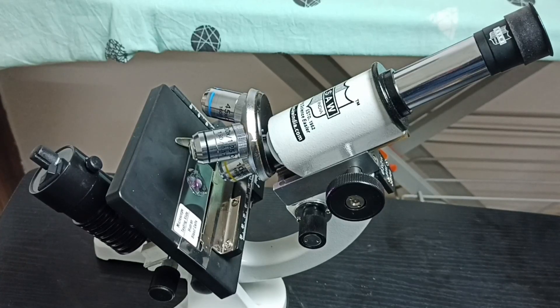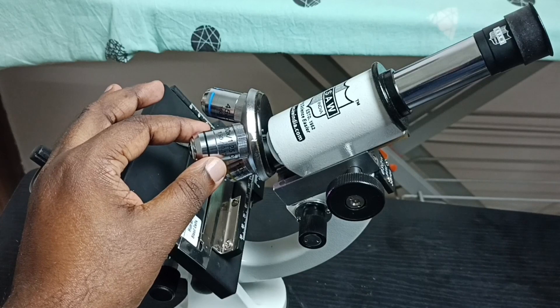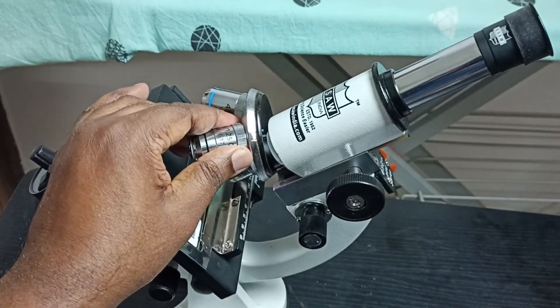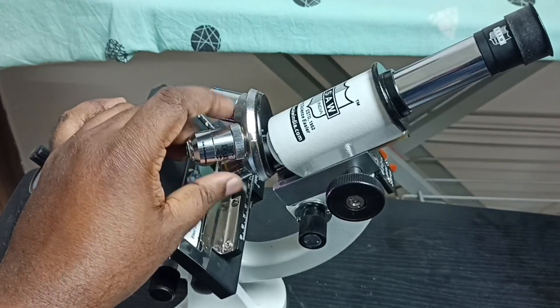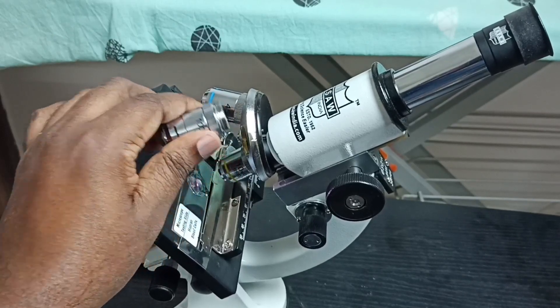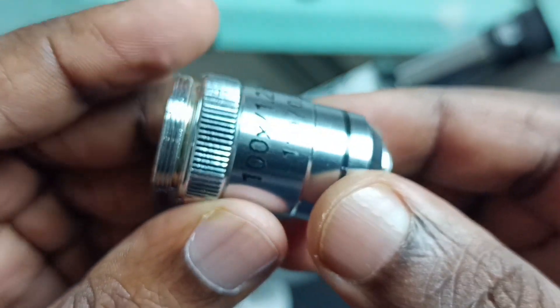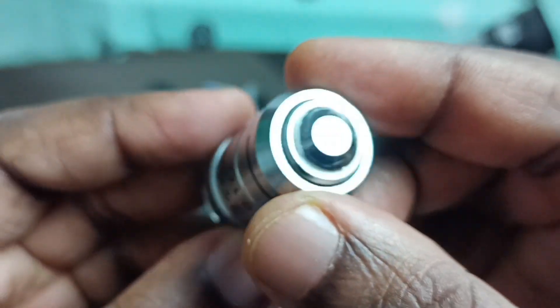Hi friends, this video shows how to clean the objective lens of a microscope. I am going to clean this 100x objective lens. First, let me remove this lens from the microscope. This is the 100x objective lens.